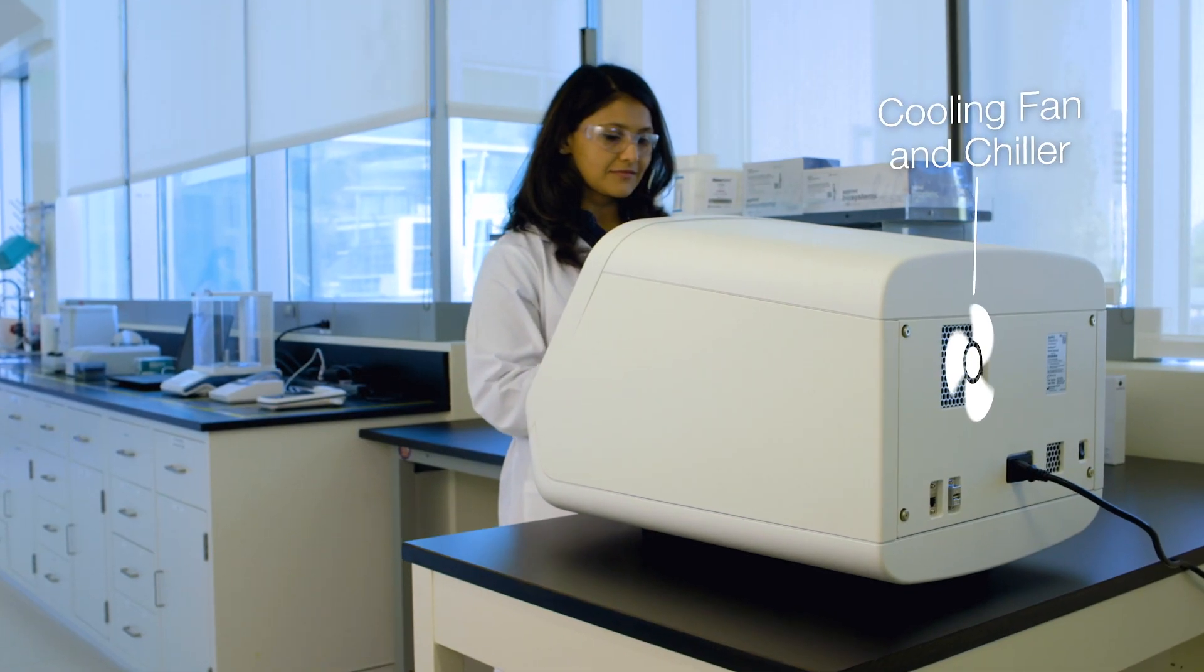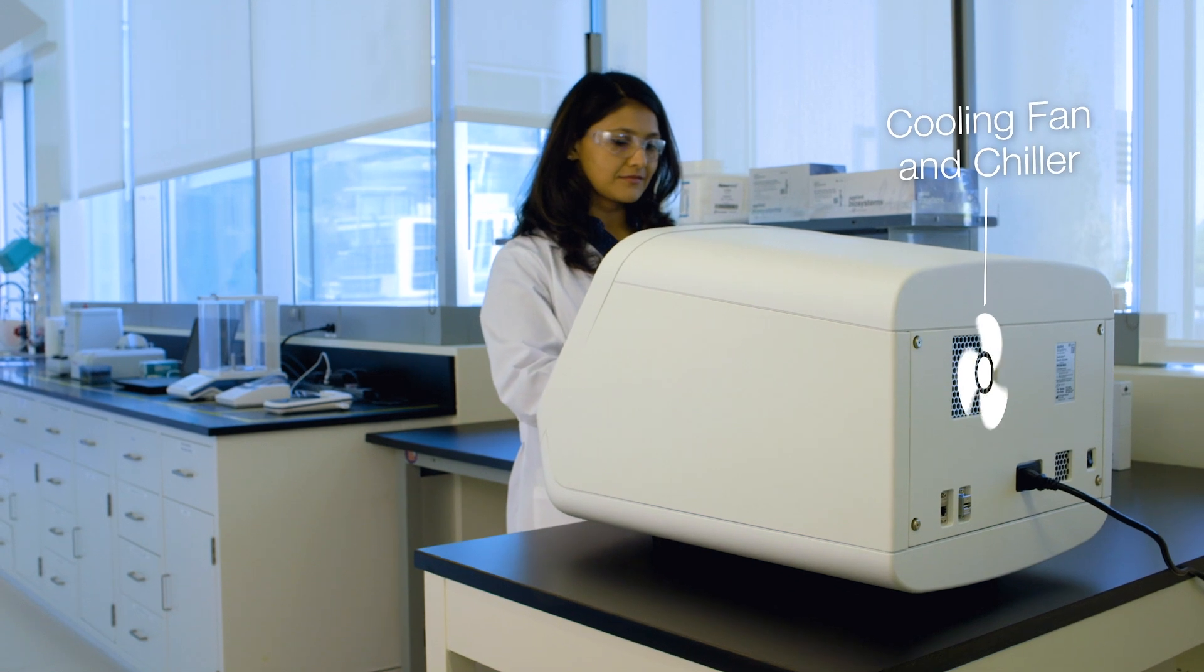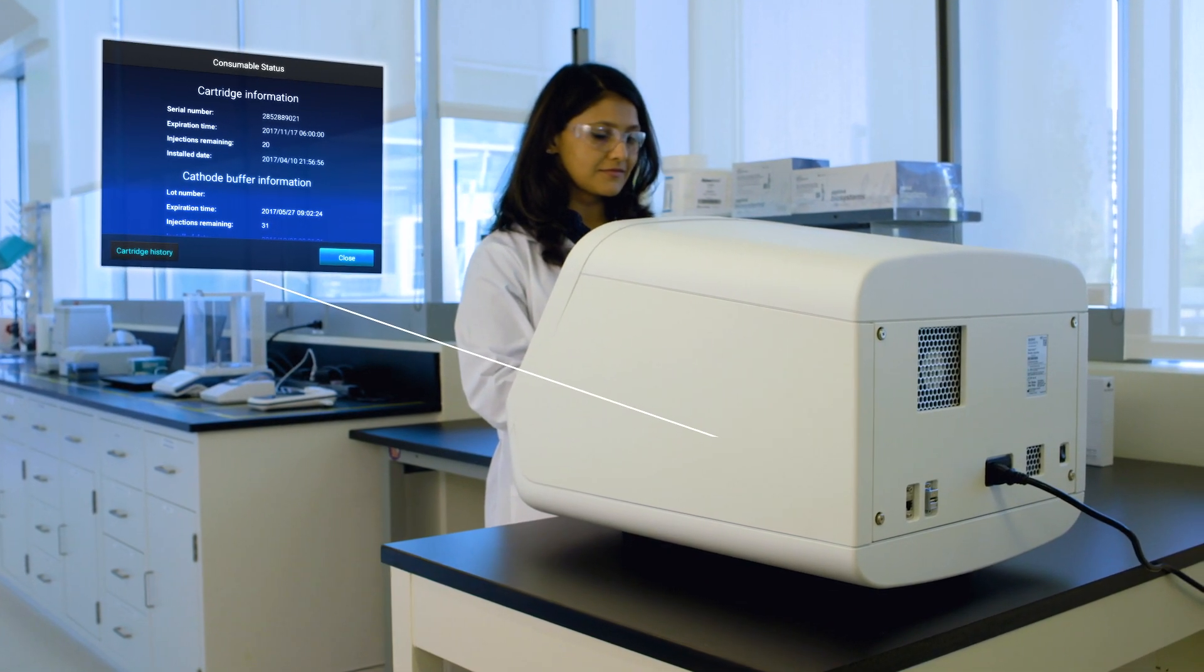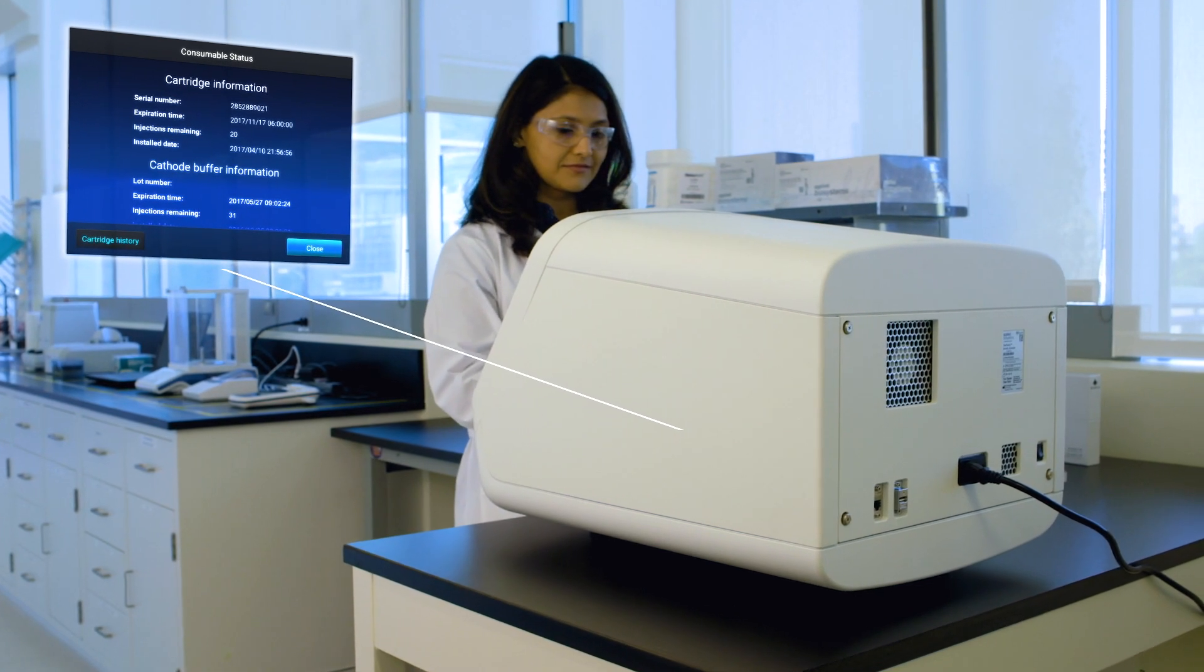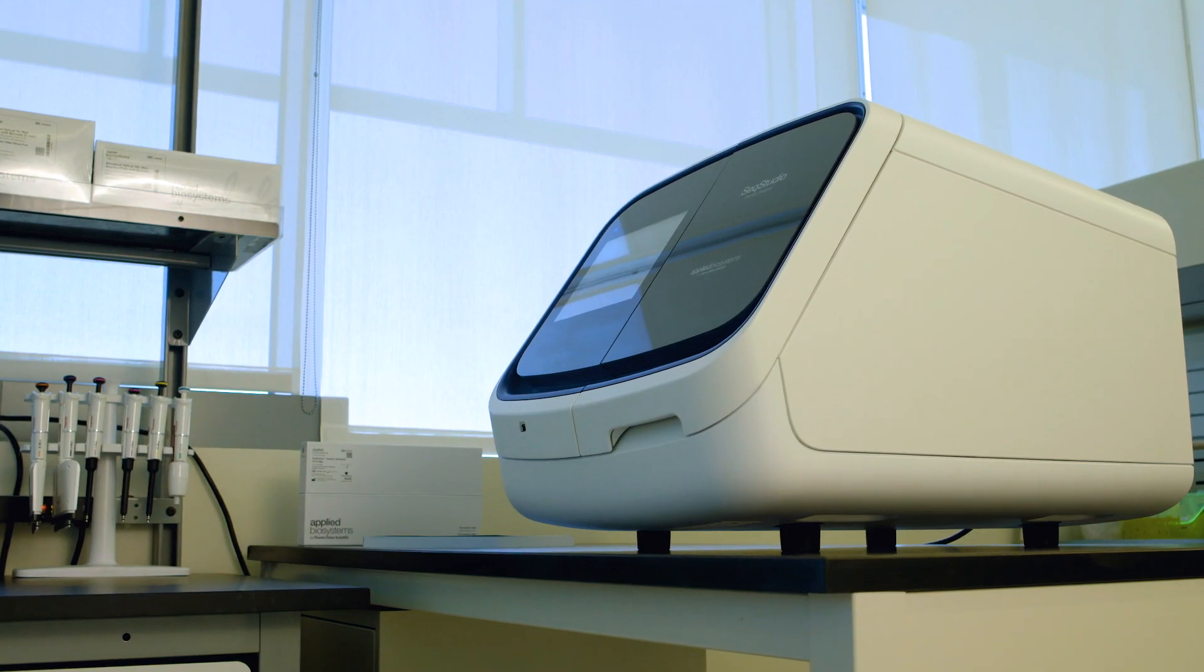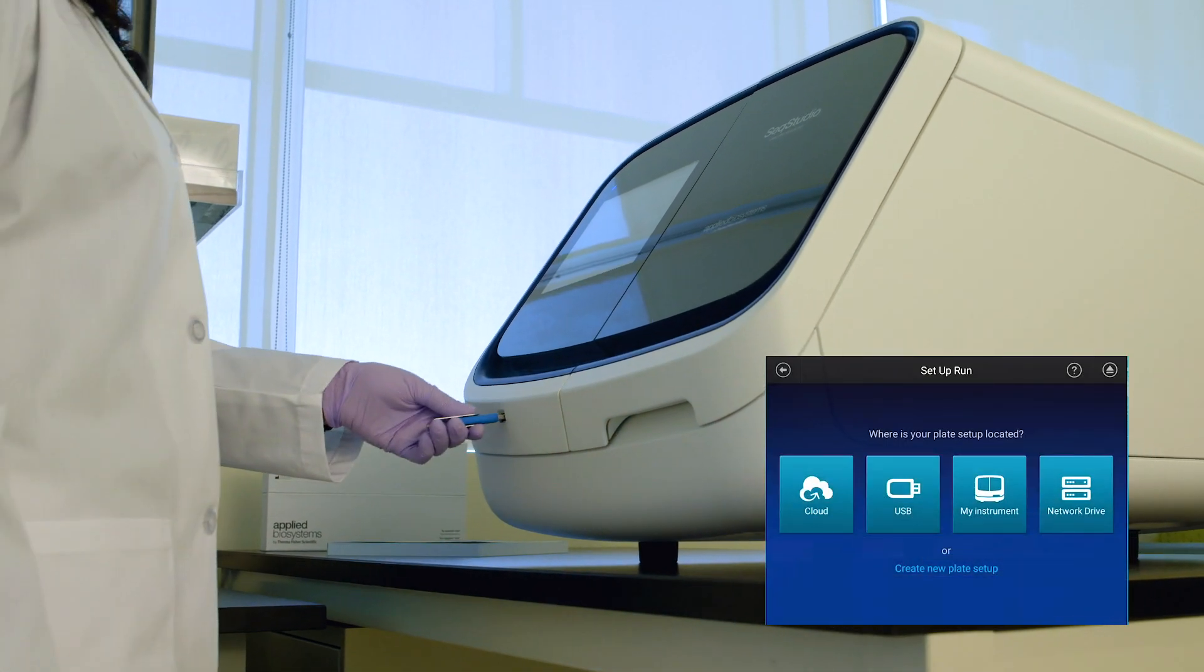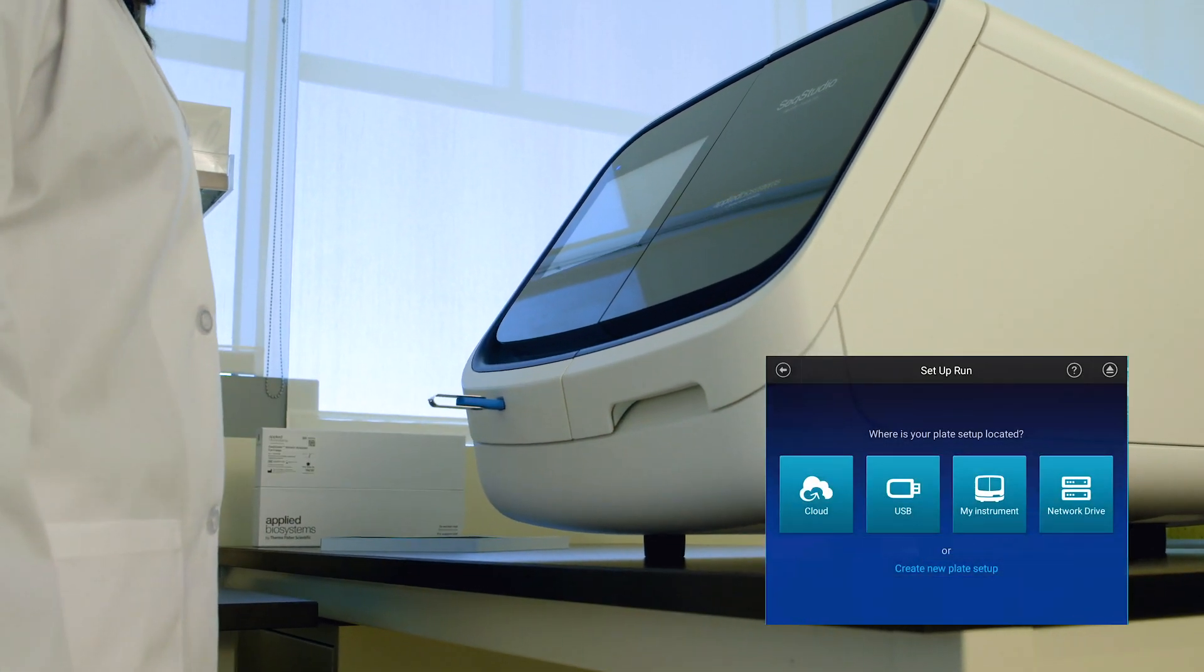A cooling fan on board helps reagents last up to four months. All SeqStudio consumables have RFID tags, so tracking is automated and easy. You can set up your run remotely or right on the instrument.